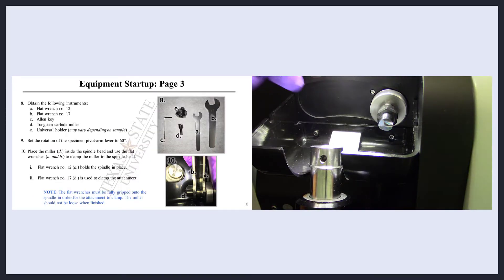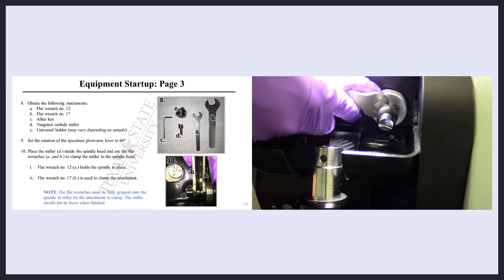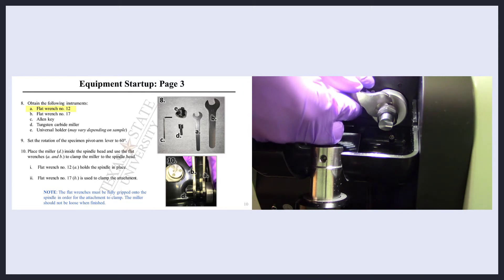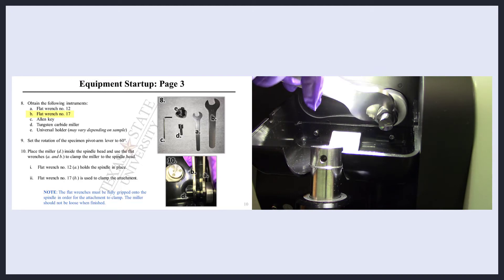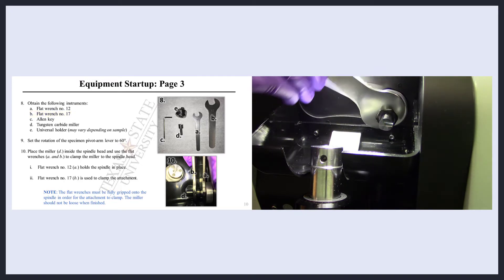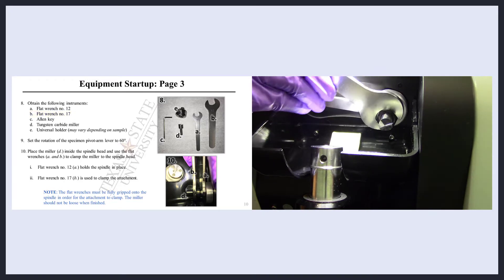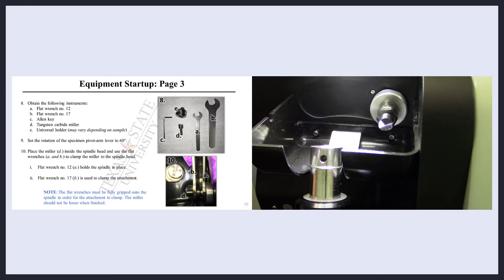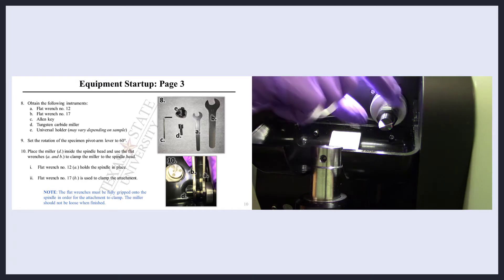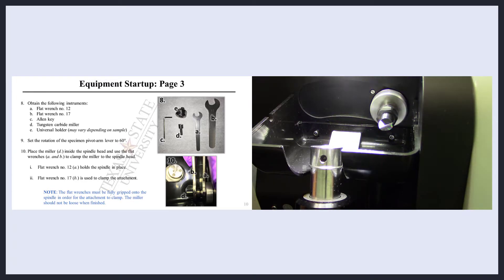Place the miller inside the spindle head and use the small flat wrench number 12 to hold the spindle in place. Then use the bigger flat wrench, number 17, to clamp the miller in place. Be sure to gently pull on the miller to ensure that the miller is fully clamped into the spindle head.